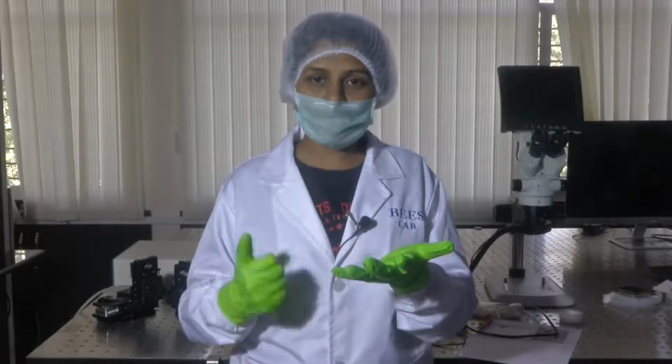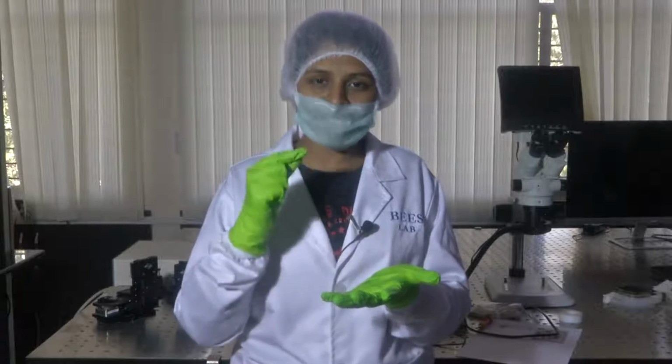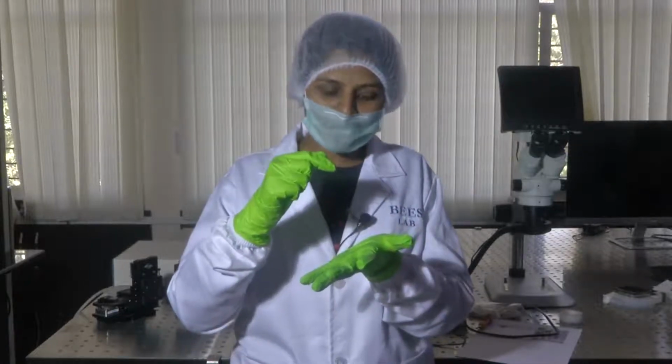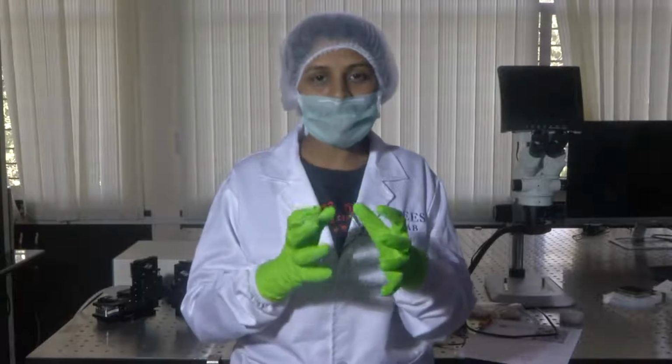And using the manipulator, you can see how precisely, on a micron scale, you could use them to precisely control the entire system.